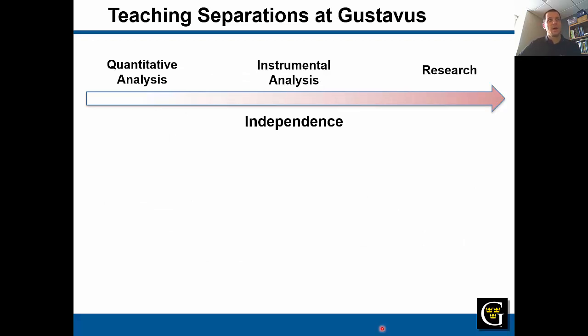So in terms of thinking about where it fits, I think about my work with students as covering a continuum running from quantitative analysis through to research experience. And of course, we see that their independence grows as they move through these experiences. The HPLC simulator, I would say, I primarily use in my courses, but occasionally we also use it for some of our research activities.